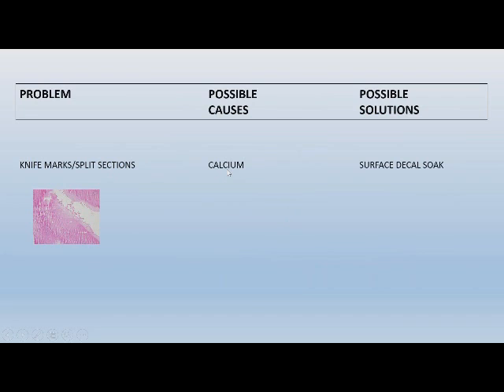Could be calcium in there. We get that in breast biopsies and other things. Surface decalcification might work, or send it back through. Change blades, obviously, after you ruin the one that you're using.